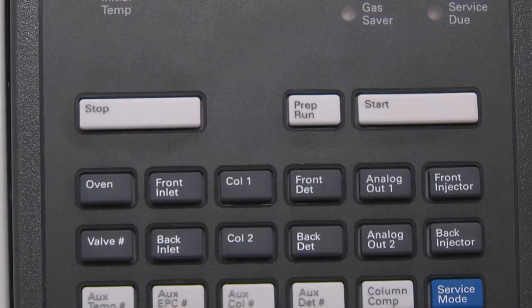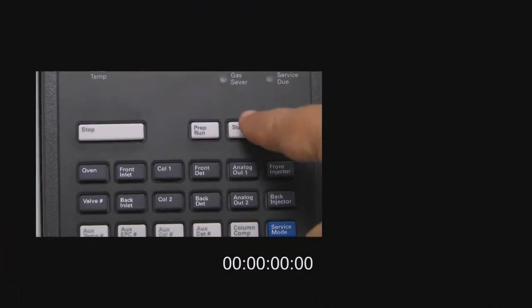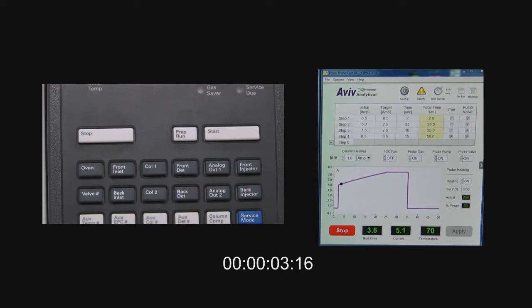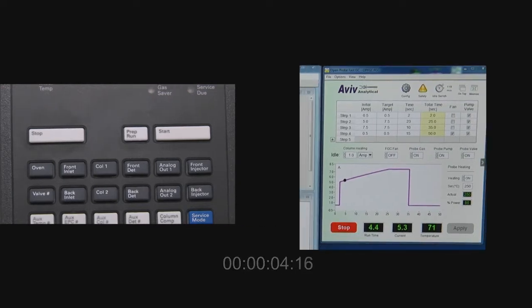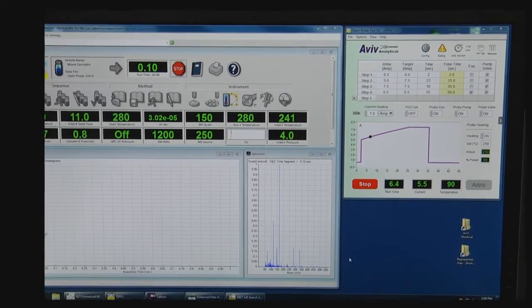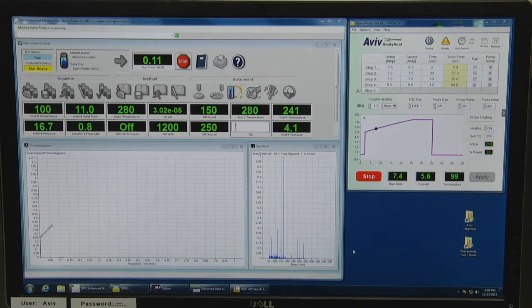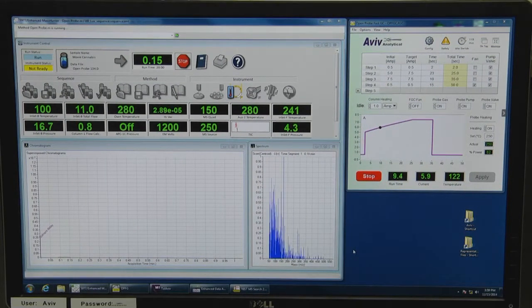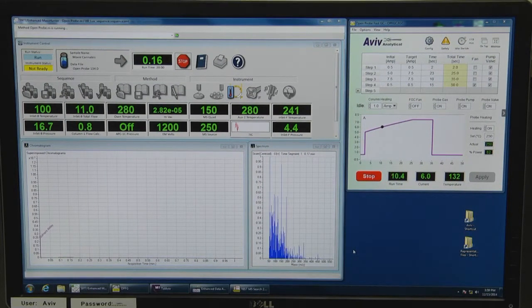We push the start button either on the Agilent GC or the OpenProb, and it starts the MS data collection while at the same time it also starts the FastGC temperature program.